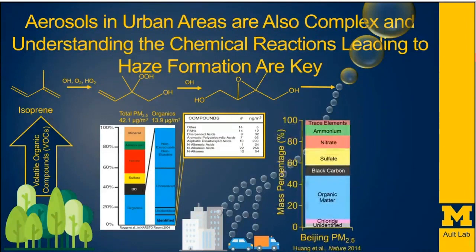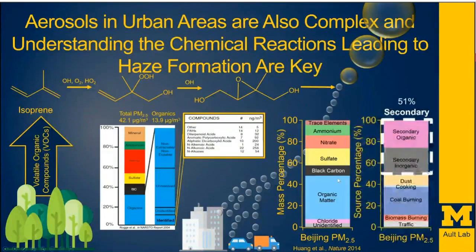And so in more recent years, we've been able to identify that we still have roughly, this is for Beijing just about a decade ago, we have similar fractions of these different types of particles, but if we look at how much of this is coming from these atmospheric reactions, like you're seeing over here on the left side, it's over 51%, either for organic molecules like we're seeing, or for inorganic components like sulfate or nitrate mixed with ammonium.